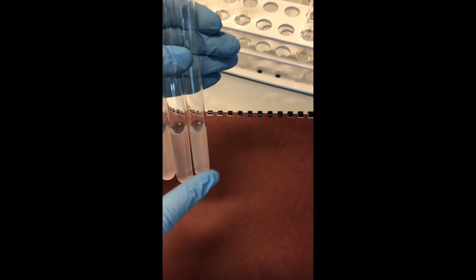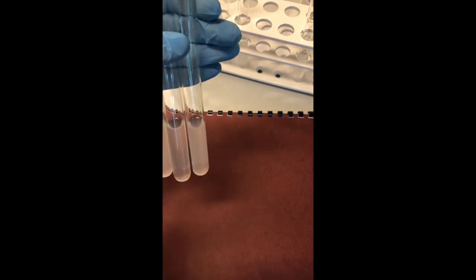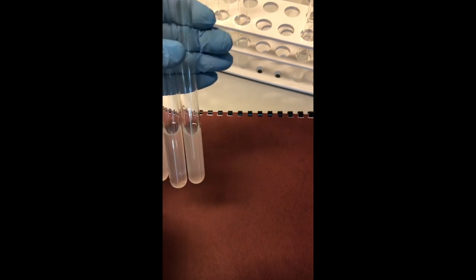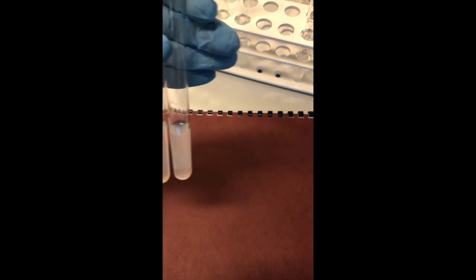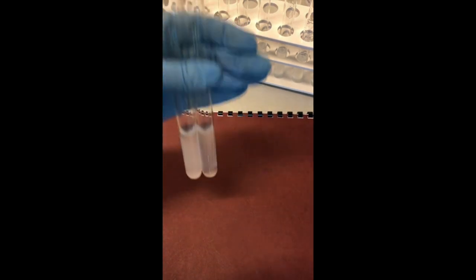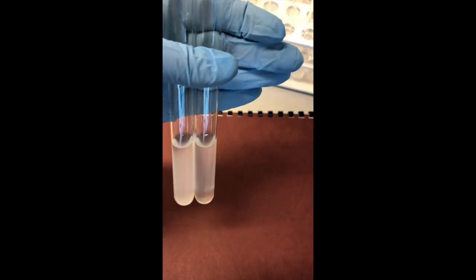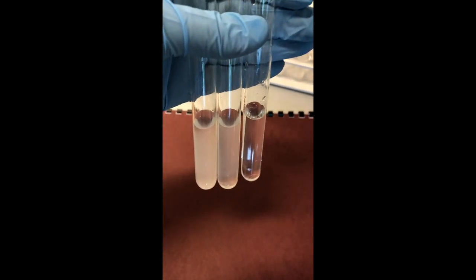When we compare, this is 0.3, this is 0.4 cubic centimeter of standard solution. So here it is well seen that our sample is lower. You can of course compare it with the highest concentration, and you see the difference very well, and this will be the 0. So you see the difference.